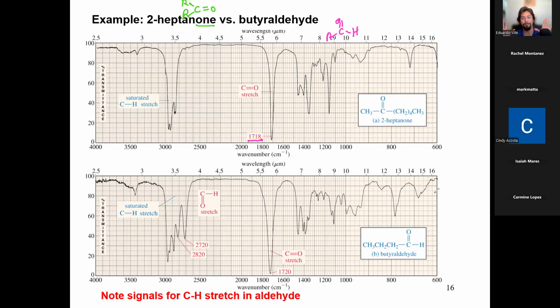Very iconic, very characteristic. Once you see it, once you learn it, you can't really miss it. This is like not knowing the Beatles. This is like not knowing Buddha. This is like not knowing Jesus. Some things are iconic. This is the iconic signal of the IR spectra, the carbonyl peak. If you find it, you have some carbonyl functional group.